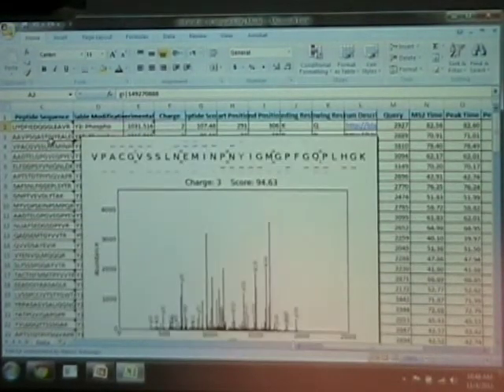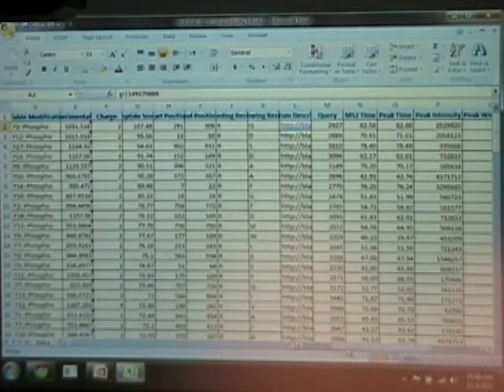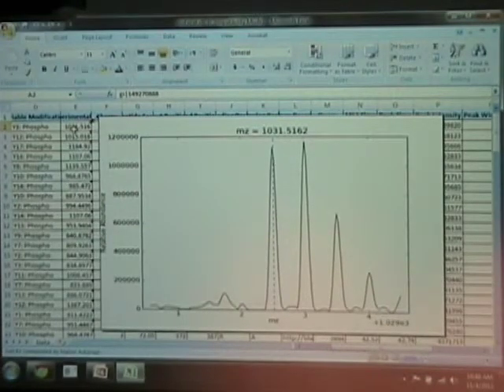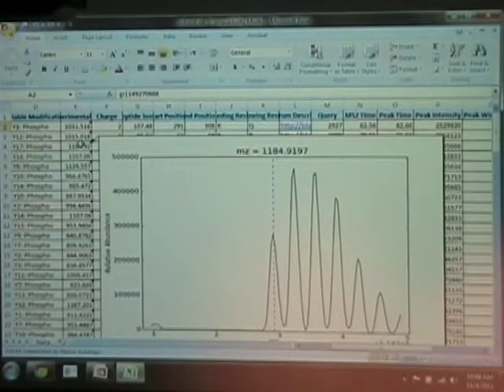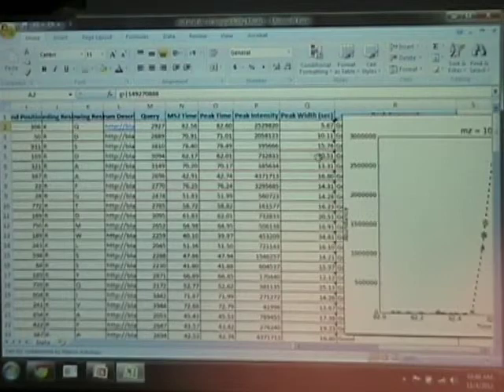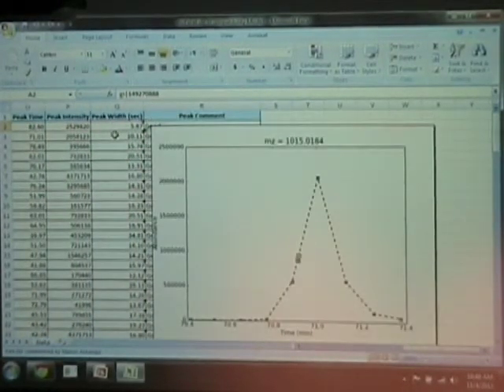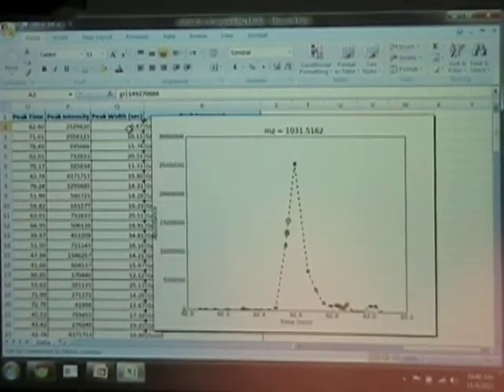So when you're giving somebody a report, they can see the image, and because our tools look at the raw precursor information, not just what the search tool gets in terms of MS2 scans, we can also incorporate precursor information so you can check that it's pure. And also, you can look at the chromatographic peak. But you can see how this is a little bit hokey. It's canned, first of all, and secondly, you have to move things around.